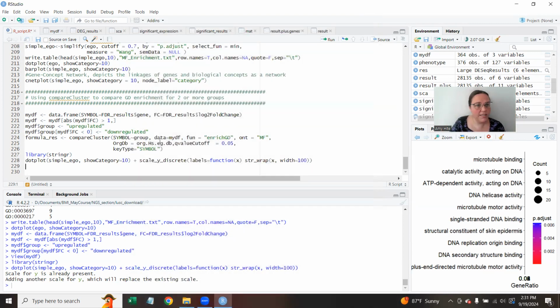Okay, so this is running through the script of how to do differential expression analysis. Thank you.